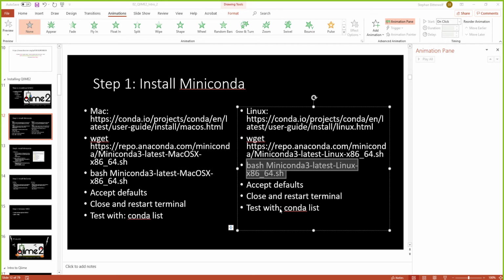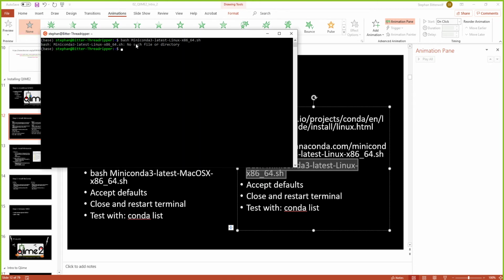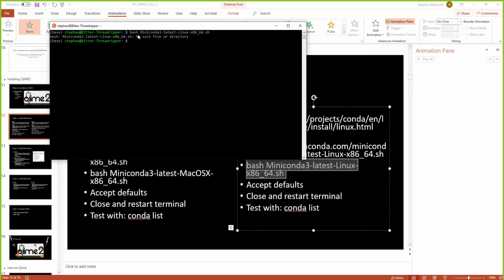And it's like a right click to copy or paste. That's right. So you would right click. If you're pasting into anything, you just right click. But what will happen usually is it'll run the command immediately.